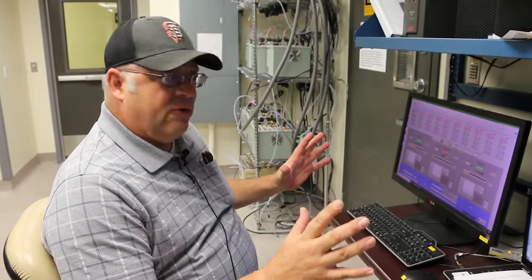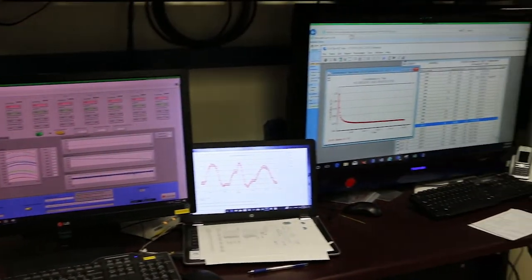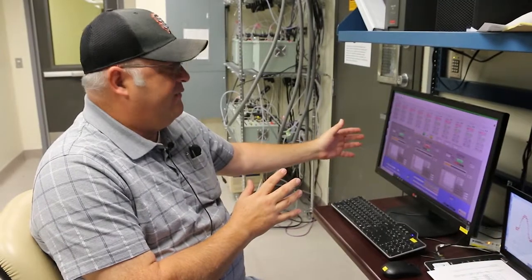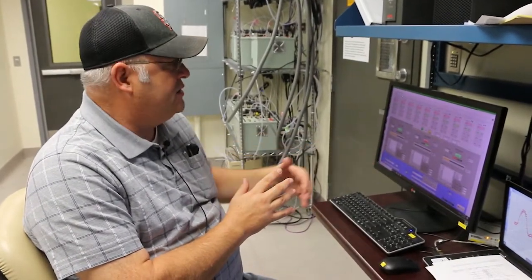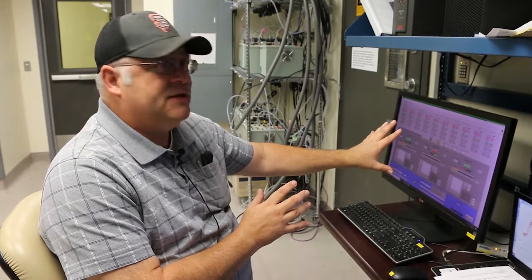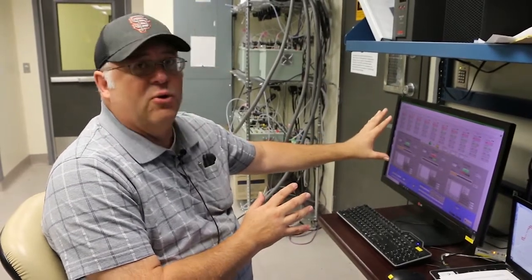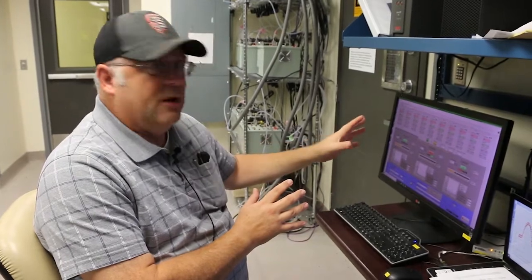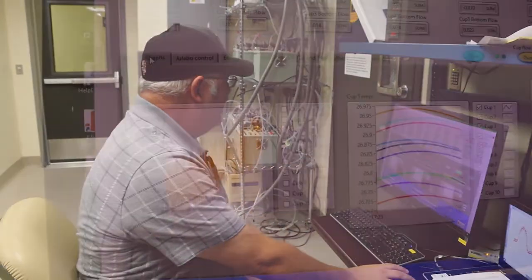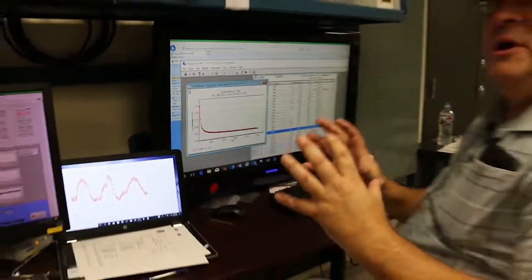Okay, so the fixture is all controlled right here. We have a station with LabVIEW on it that controls the flows in the cups, the temperatures and humidities, the ventilation and flows in and out of the glove box. It's all controlled, and you can individually set parameters that are important to the test, and have the equipment dial it right in, and it also records the data in real time. You can pull up the charts and graphs at a click of a button, and you can essentially see what's going on in the test. So we'll take all of this information and pull it together, and that becomes a data package that supports our test reports to our customer.